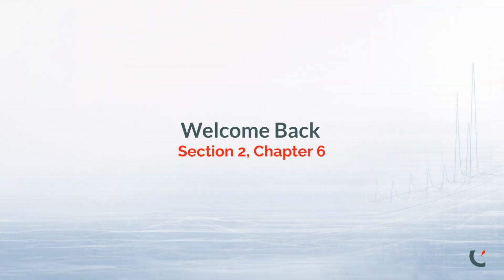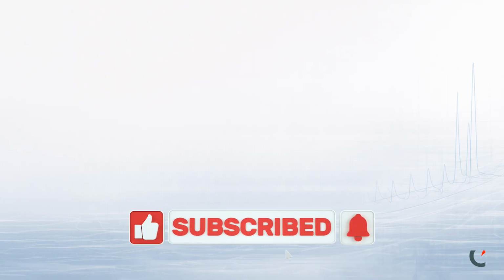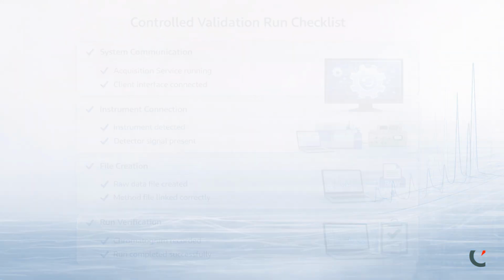We are about to start Chapter 6, which completes Section 2, where we have been learning about Chromperfect methods and files. In Section 1, we introduced the A-test method during a controlled validation run. That exercise confirmed communication between the acquisition service and the user interface, verified instrument connectivity, and ensured that files were created correctly. In this chapter, we adapt that same A-test configuration for a real chromatographic acquisition.